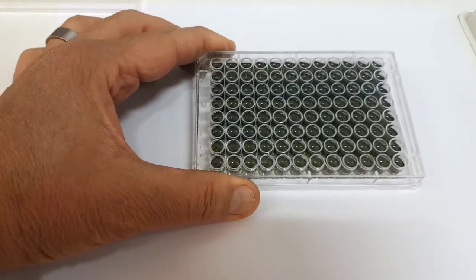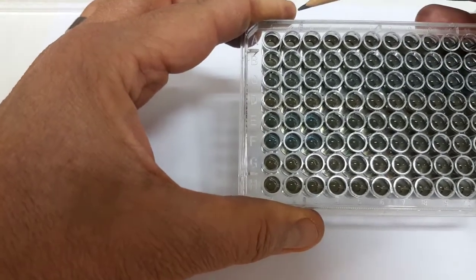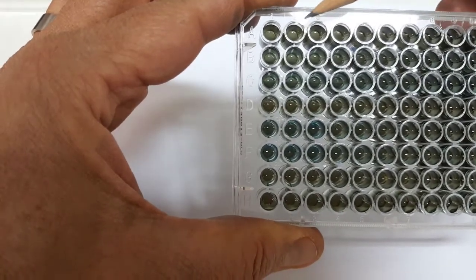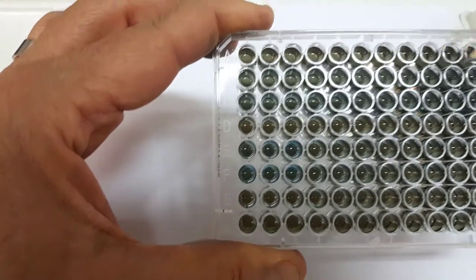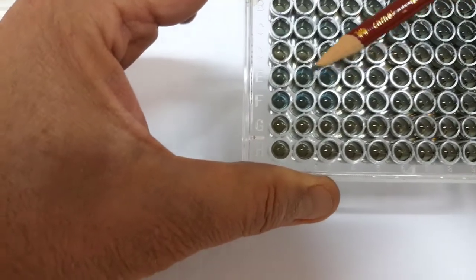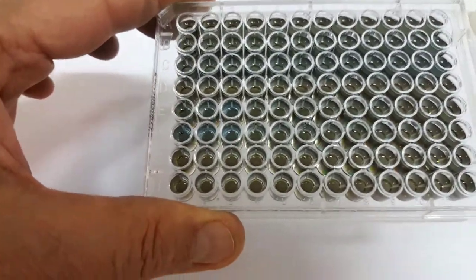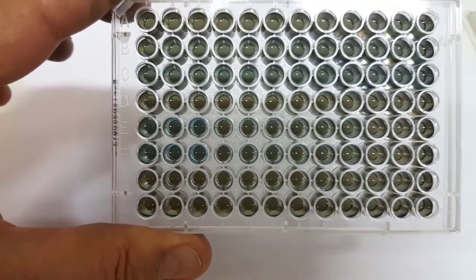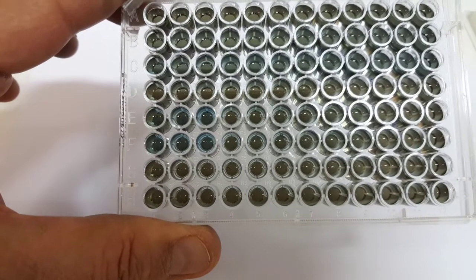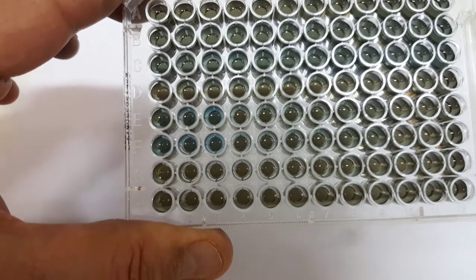Okay, as you see, the color in each well changes from brown related to the blanks to blue related to standards and samples. The higher the protein concentration in the standards or samples, the more intense blue color.